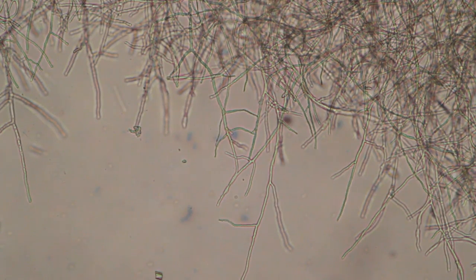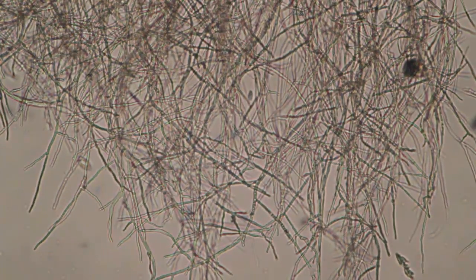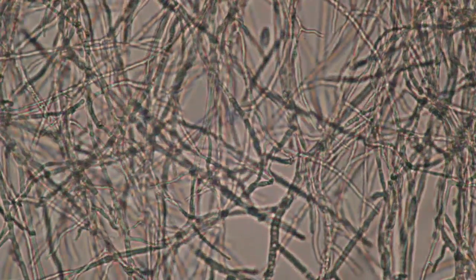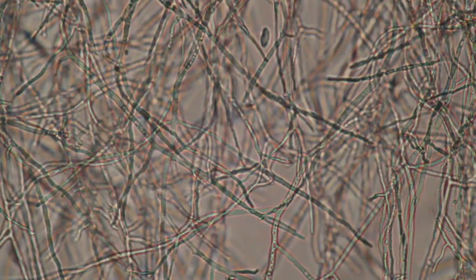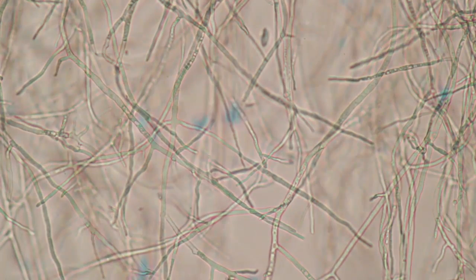The cells are of course branched, because that's very typical of a fungus. At slightly higher magnification you can see that I'm focusing through the mycelium right now. A little bit of dust in the background unfortunately. That is with the condenser closed to increase the contrast. Yet another higher magnification — different layers of the mycelium move in and out of focus. Right now it's a little bit brighter because I'm opening the condenser aperture diaphragm.